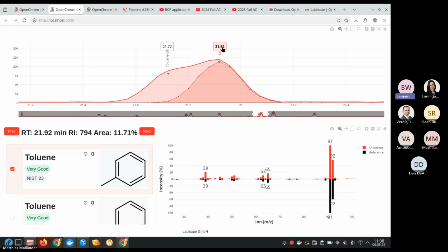And I also need the full spectrum, because what you see here on the left is a database hit table, again from the NIST 23, a results table basically, and it shows the spectrum from the chromatogram and the reference spectrum against it to match. So I need the full spectrum. The total ion current here could still show a pretty chromatogram, but we couldn't really process it. So we are going for the full data.